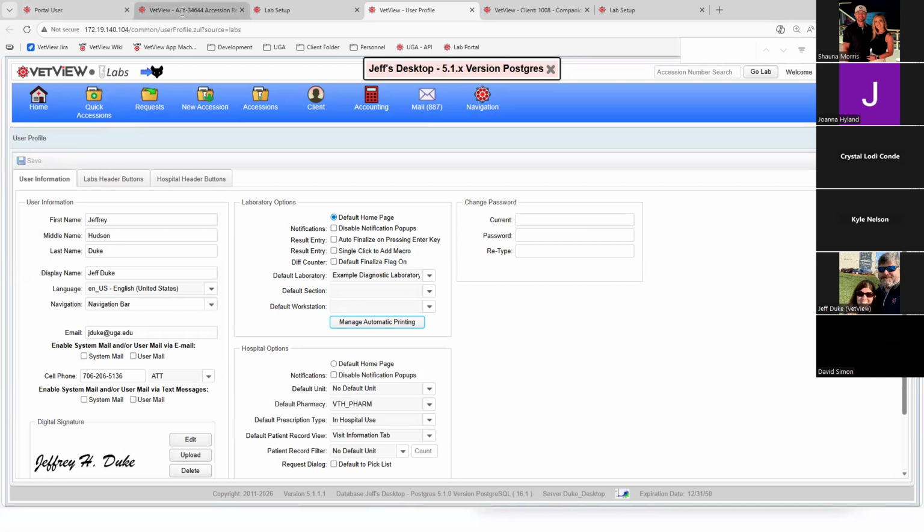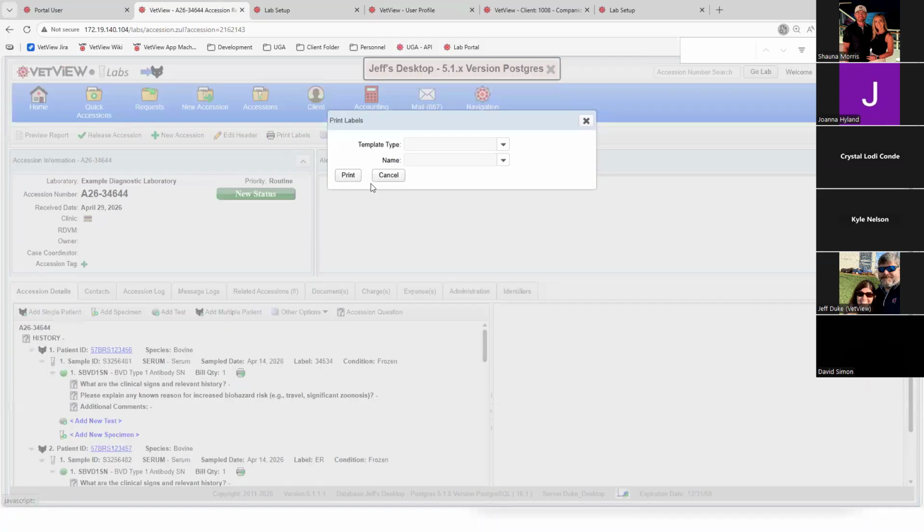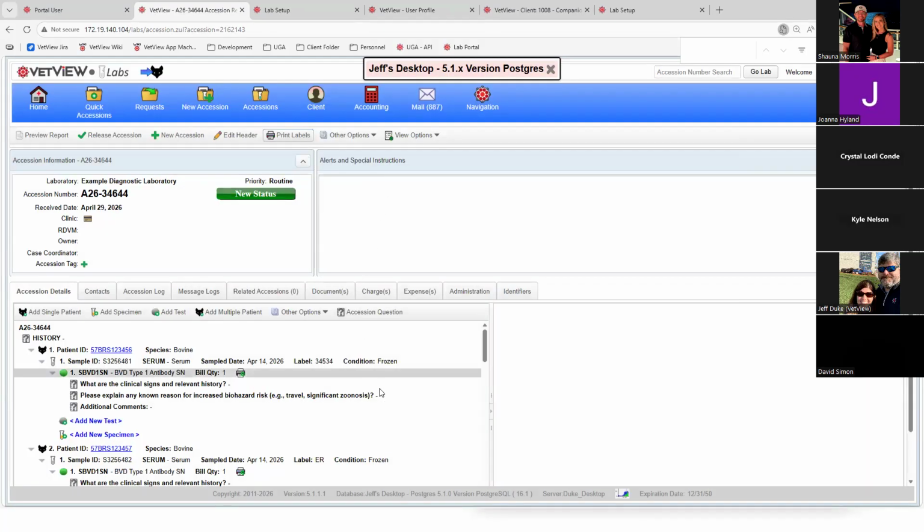All right. So back here. Okay, so printing out labels, again, you can do it one by one. You can also do it in mass up here through the printing labels. You can have it auto printing. Those are things that you want to do. And again, as you notice, this is still in the new status. I don't even have client billing parties. Again, that doesn't prevent you from getting your labels out, because that's an important part of getting that out, getting it labeled quickly.